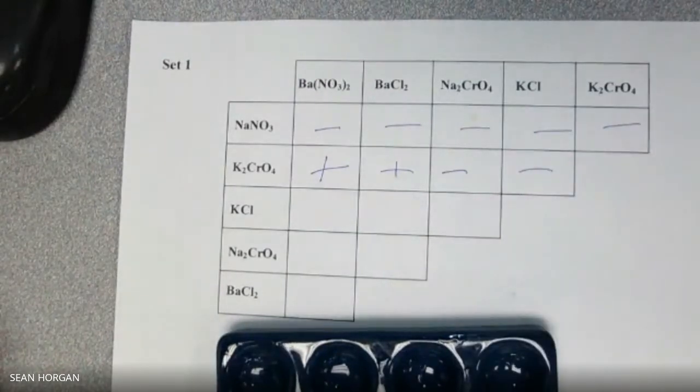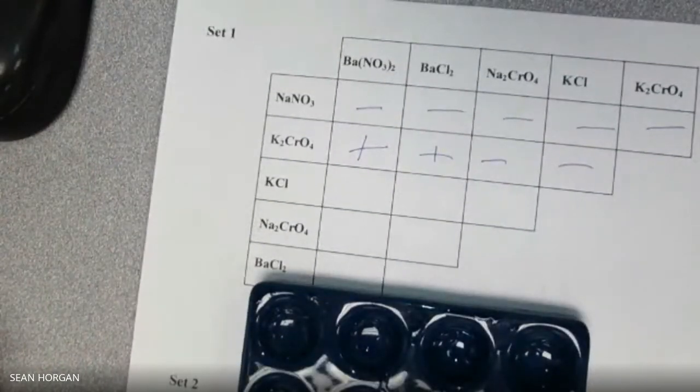We'll do the next one, KCl and three of them. Here we go.